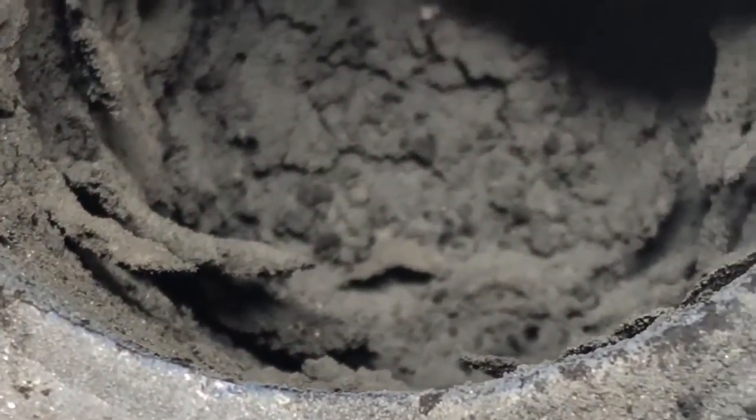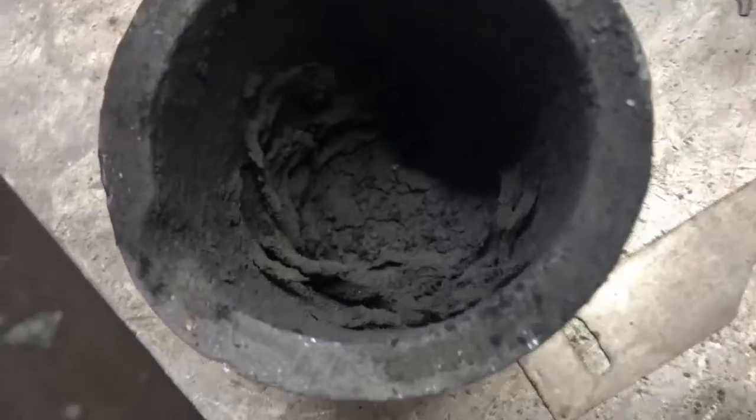It looks like the stuff I've seen on other videos, so this is basically what we end up with. It looks like this every time, no matter what way you do it — it's a very flaky, very light material.